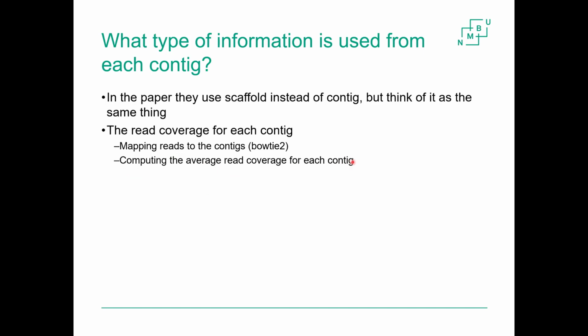And then, of course, the contigs that come out with more or less the same coverage are probably, or at least candidates for, coming from the same genome, right? It's not a guarantee though, because two different genomes can easily have the same coverage. But if contigs have wildly different coverage, they cannot come from the same genome, at least. That's what we can say here now.